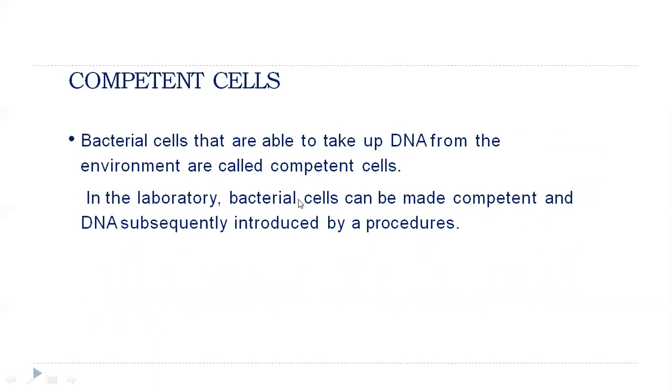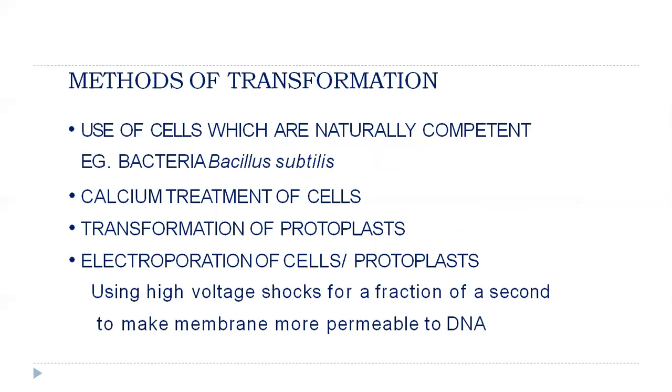In the laboratory, bacterial cells can be made competent and DNA subsequently introduced by a procedure. So in lab conditions, for our experimental needs, we can develop the bacterial cells into competent cells. There is a protocol, which we will now discuss.